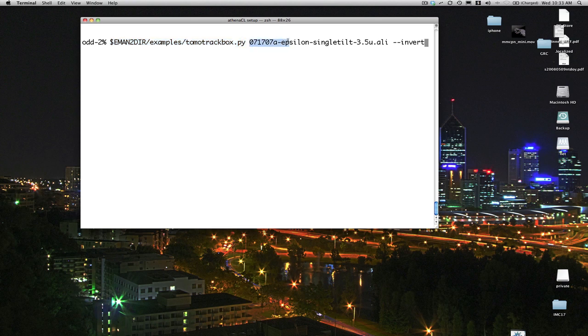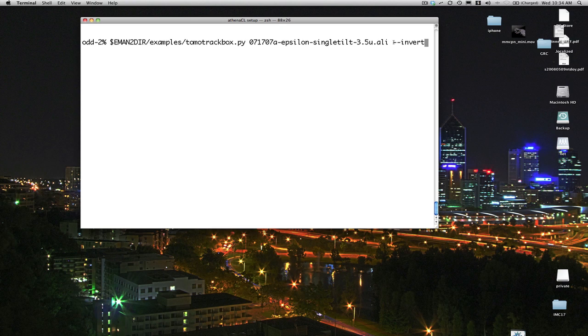Then simply pass the name of the file containing your tilt series. In this case, my tilt series was recorded with a dark protein on a lighter colored background, and EMAN prefers it the other way around, so we specify the invert option, and that'll make the protein particles white.